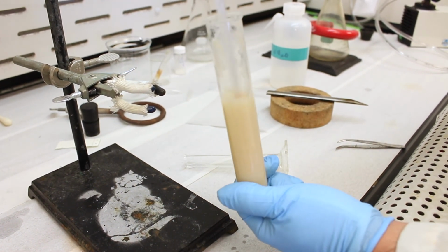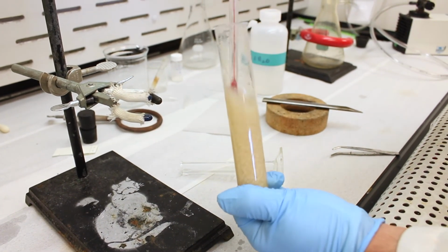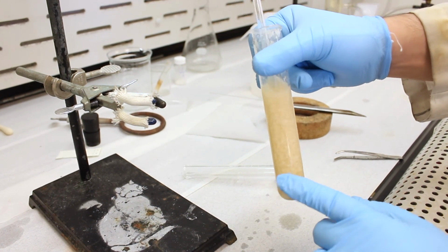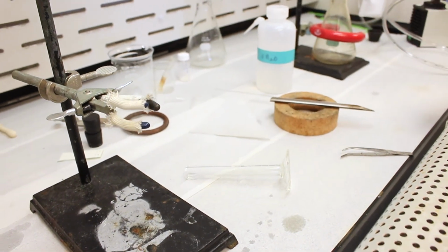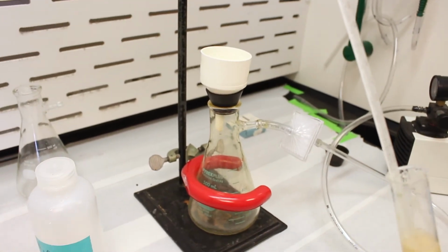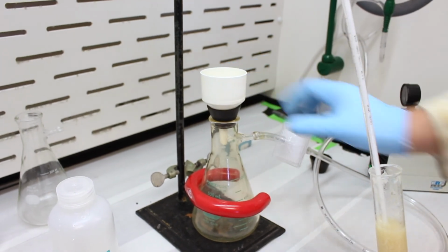Yeah, it looks like we might lose some of it on the sides here. Okay, so I think that's sufficient. Now what we're going to do is filter this, so isolate the solid. And over here we have our filtration apparatus. Sorry, we had a camera issue here, but we've set it up, so we've got our vacuum filter.